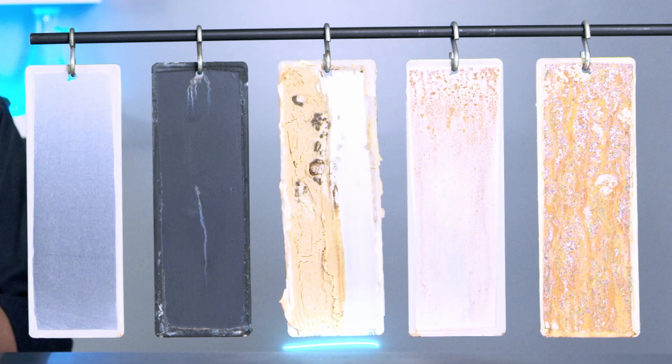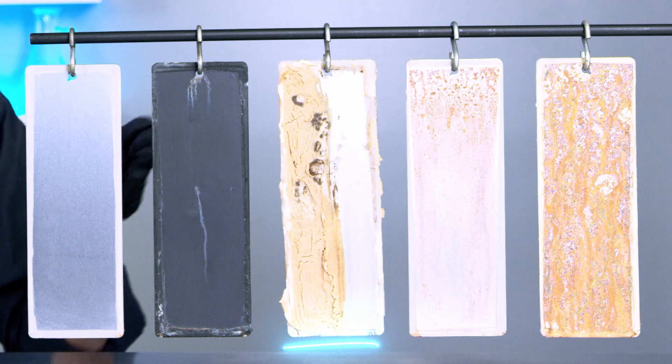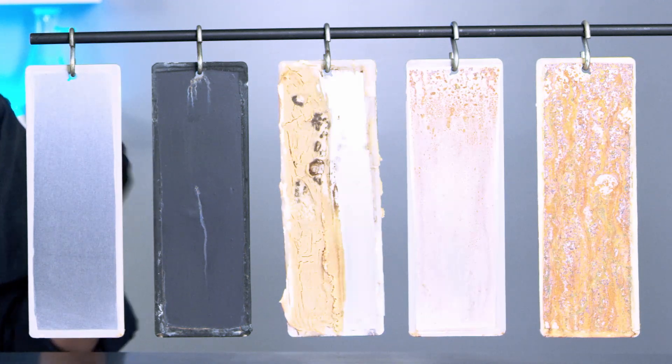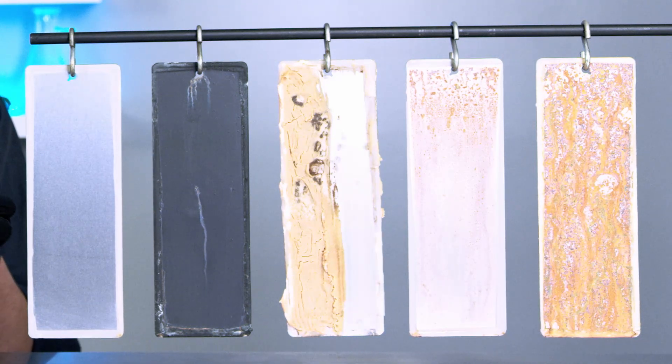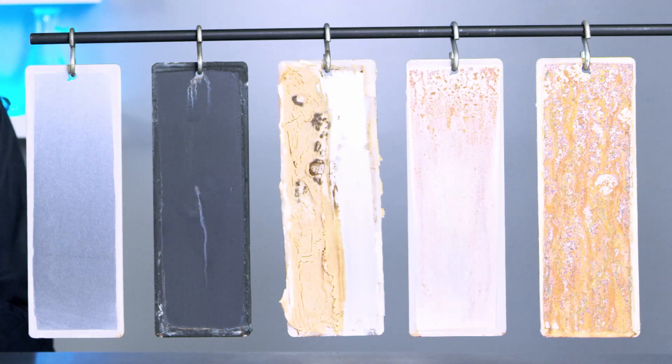The third panel we applied peanut butter, and you can see we've removed half of the peanut butter so you can see the bare metal, and it has held up quite well at preventing corrosion on that metal.